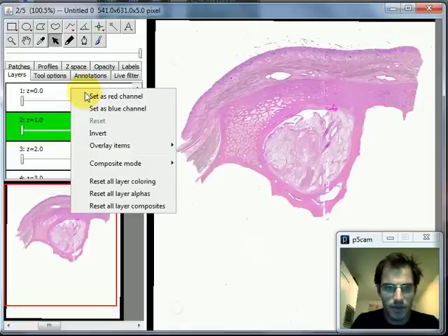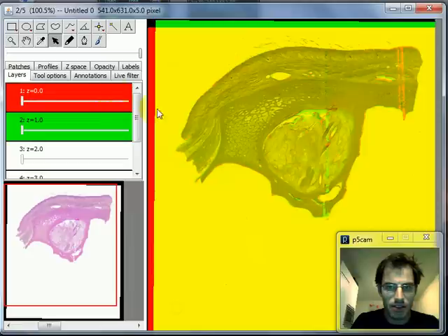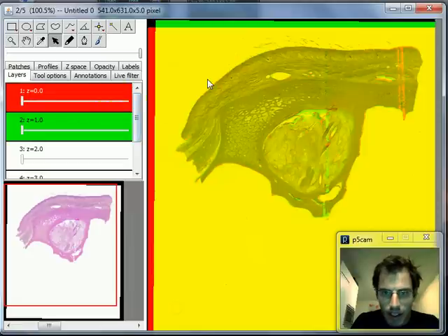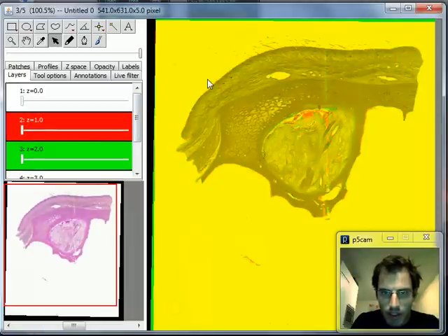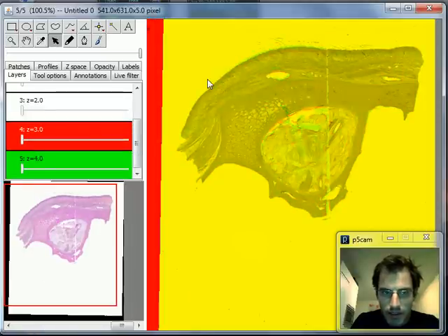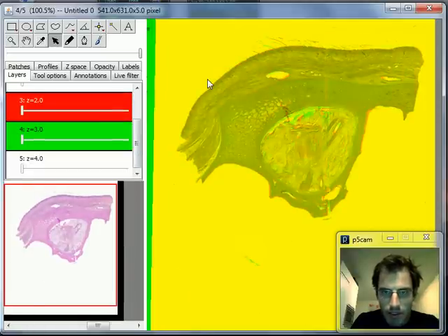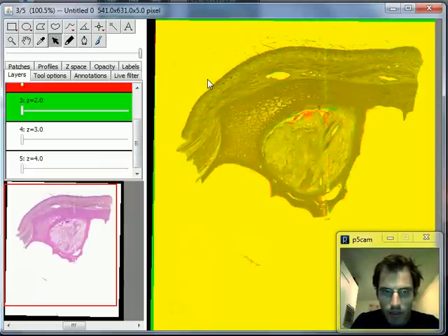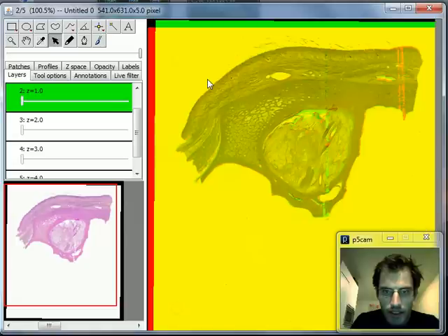Then right-clicking on the slice before it, the layer before it, set it as red channel. And now scrolling to the stack, you can see it did a pretty good job of aligning these sections of the human orbit.